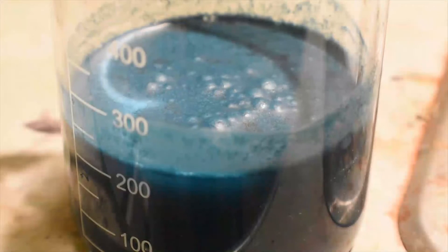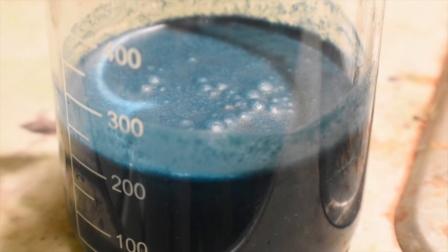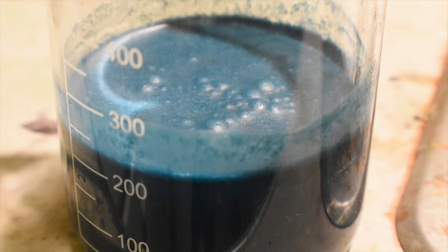Here it is after everything's been added. It looks a little bluer on camera than it is in real life — for me it's more of a teal color or turquoise. Now all I have to do is filter it. I'm going to use a vacuum filter for this.